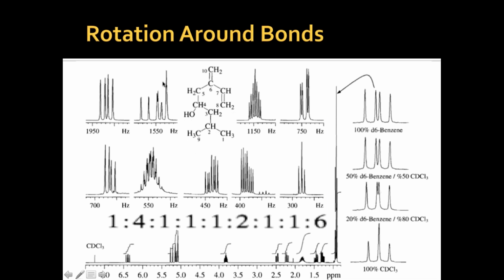Because of the rotations around, sometimes the hydrogen does not behave. It does not mean we cannot identify the spectrum. In those cases, we have to take another spectrum, C13 or DEPT or NOESY or something, right?